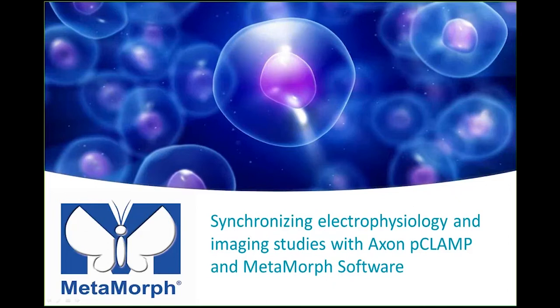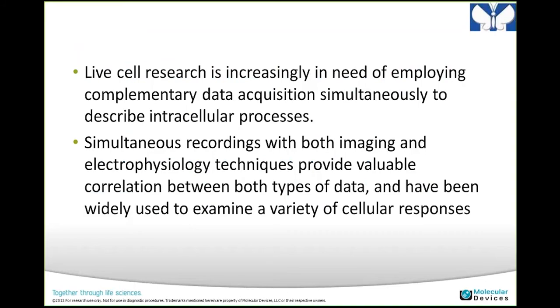Okay, so what we're going to look at on my end is the synchronizing of the electrophysiology and the imaging studies with the Axon pCLAMP and the Metamorph software. Life science research is increasingly in need of complementary data collection between both the stimulation and the image acquisition. So what we're going to look at is ways of syncing the stimulation with the pCLAMP along with the image acquisition within Metamorph.